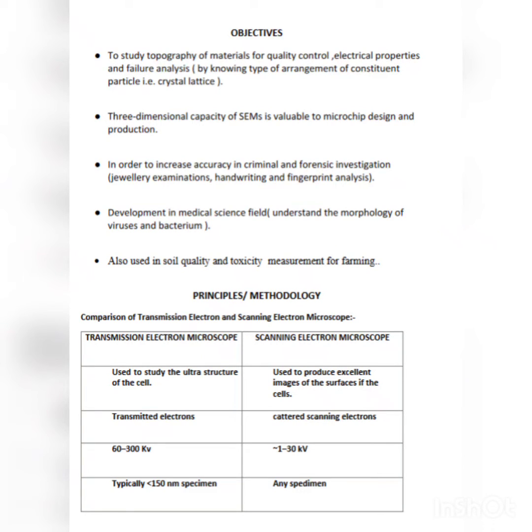Methodology. The automated nano manipulation inside the SEM. A nano manipulation system is integrated into the scanning electron microscope by mounting a head assembly onto the specimen stage of the SEM. The fine positioning unit contains a piezoelectric tube having travel ranges of 10 micrometers along the axis of the tube and 100 micrometers along each of the two transverse directions, with 5 nanometer nominal resolution.